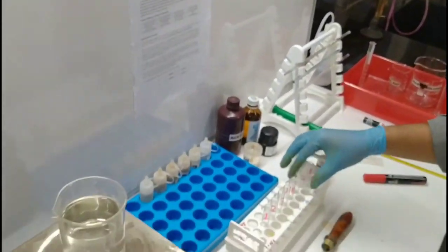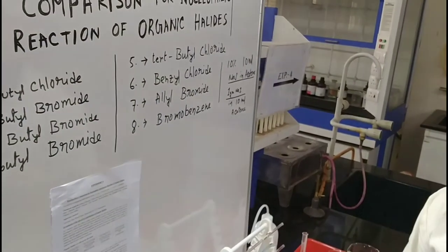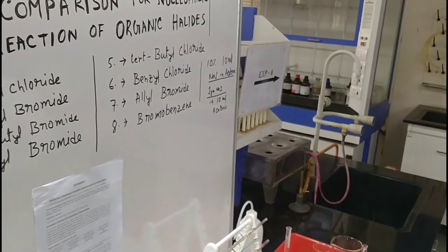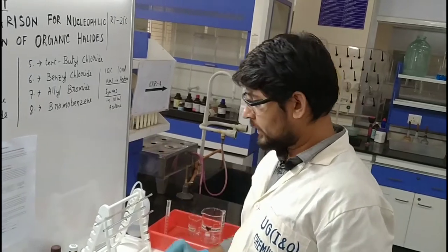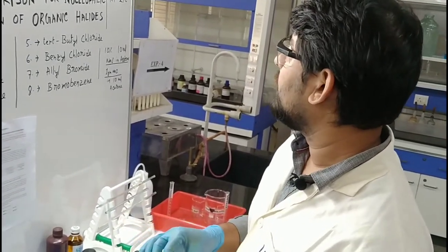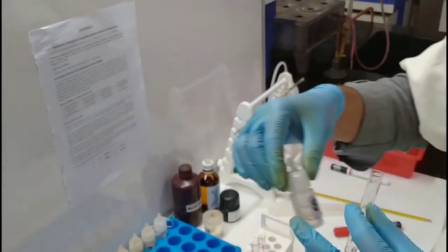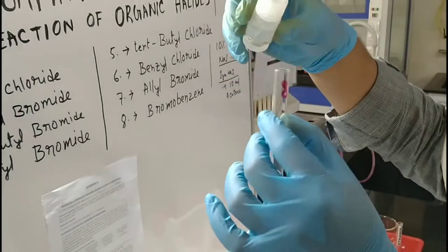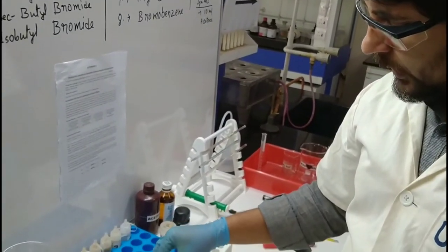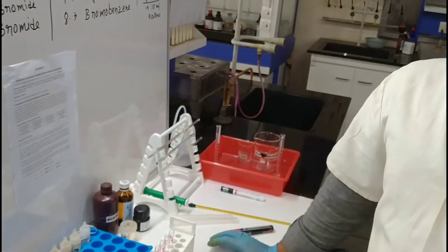The last one is the 8th — bromobenzene. Bromobenzene is not reactive for substitution reaction, so I think the 8th test tube should not give any precipitation. Let's try — I am going to add this one and keep it. Now we are going to start the preparation of the SN1 reaction.